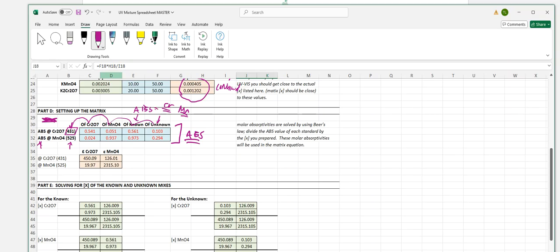The same thing happens at 525. That is your fixed wavelength of manganese. And then at 525, you ran bloop, bloop, bloop, bloop, each one of those. Those were the absorbance values. Notice what happens. Chromium hates the flavor of 525, so chromium doesn't really want to absorb, and its absorbance plummets. 0.024 is that one. Manganese loves 525. That's what it's going to get on the menu every single time. So its absorbance skyrockets through the roof, and here it's 0.937.